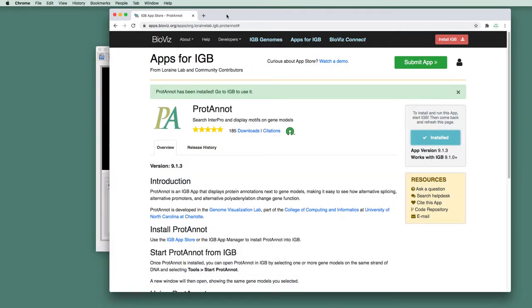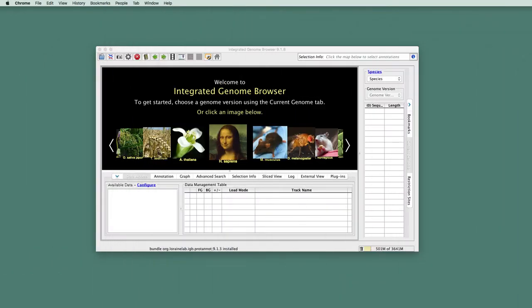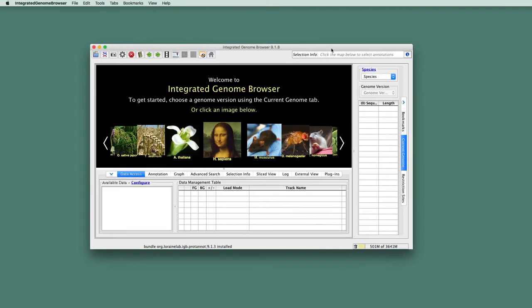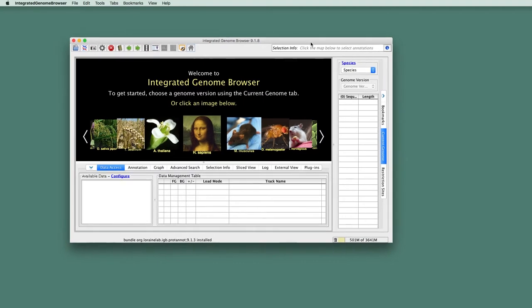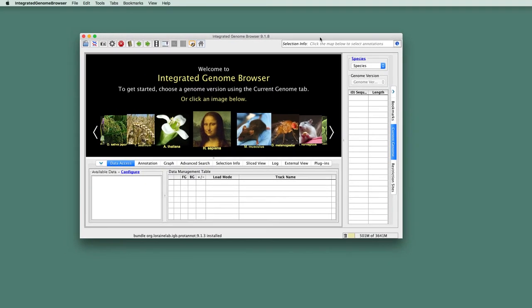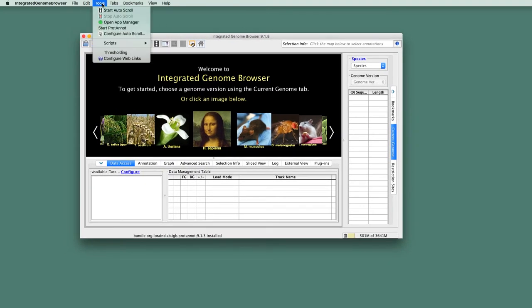Then you just click on IGB. And notice that under the Tools menu, there's an option, Start ProtoNote. And this lets us know that the ProtoNote app is installed.